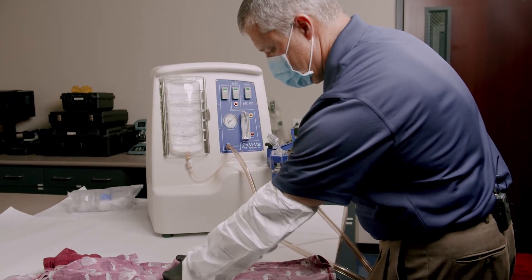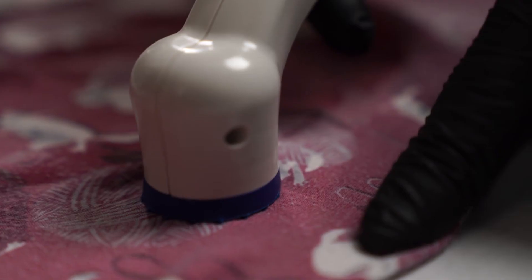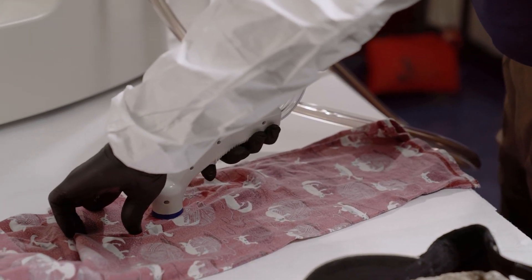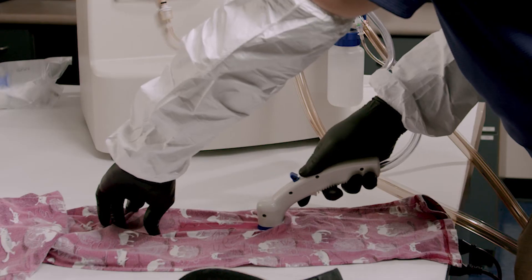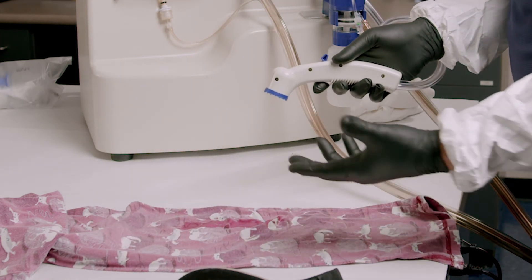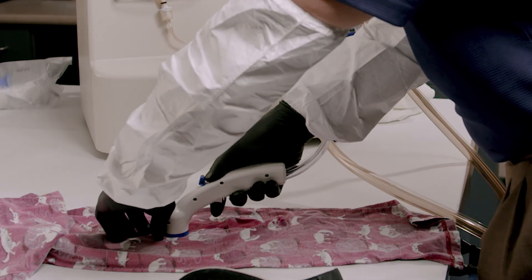You put the sampling head down, turn the solution on. You can see it's just spraying and collecting right there. You can see the nice little moist lines there — that's where you've actually collected DNA from. If my stain is about this big, I've just got to do multiple passes.